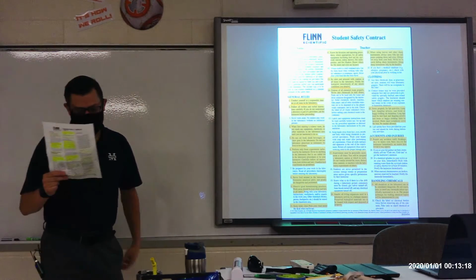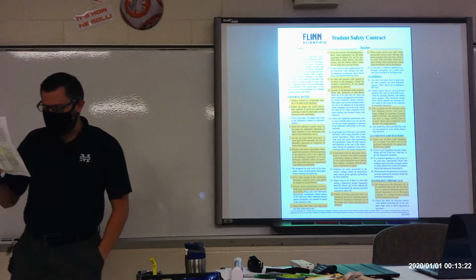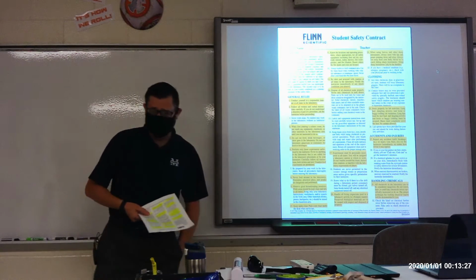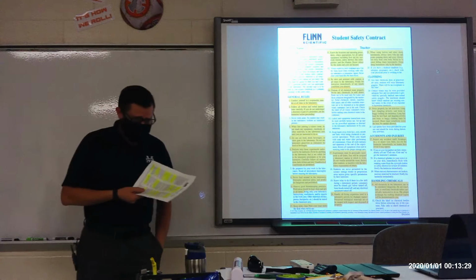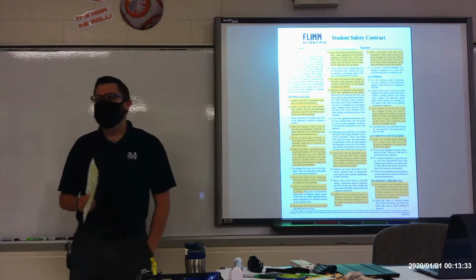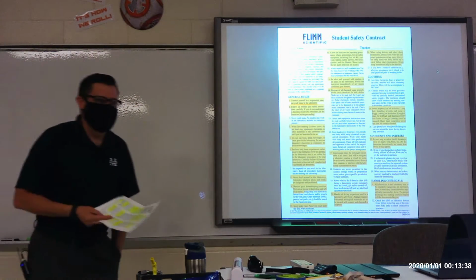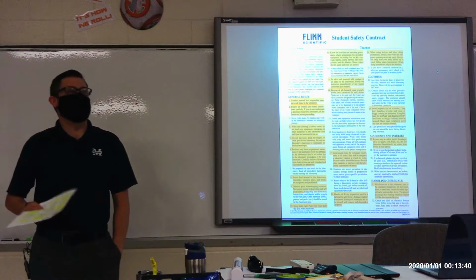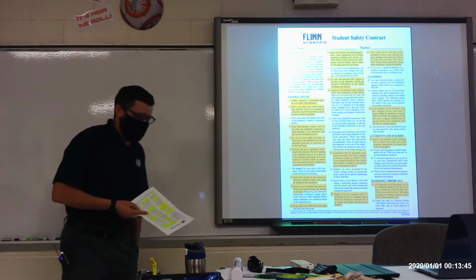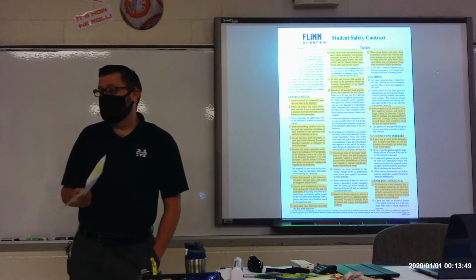All right, skipping down to number 8. Never fool around in the laboratory. Horseplay, practical jokes, and pranks are dangerous and prohibited. Again, labs are not supposed to be fun time. You're supposed to be learning something from the lab. So if you're not entertained, it doesn't mean that you have to jazz things up by joking around, because someone has the potential of getting hurt.